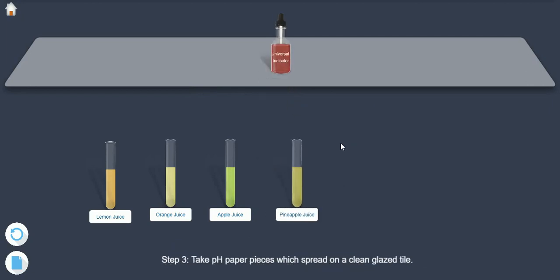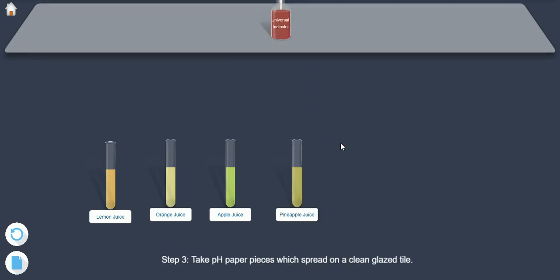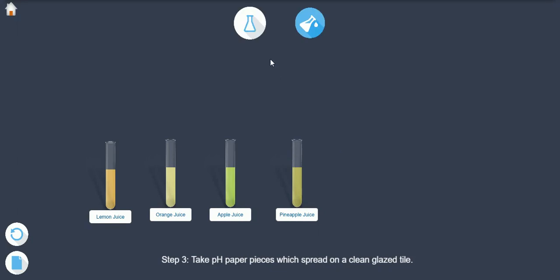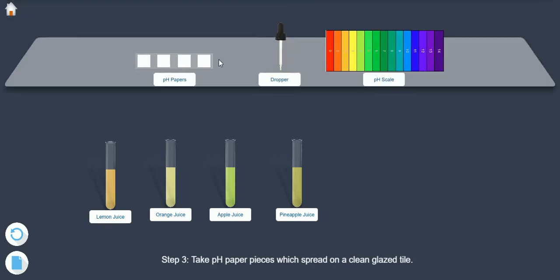Step 3: Take pH paper pieces and spread on a clean glass.